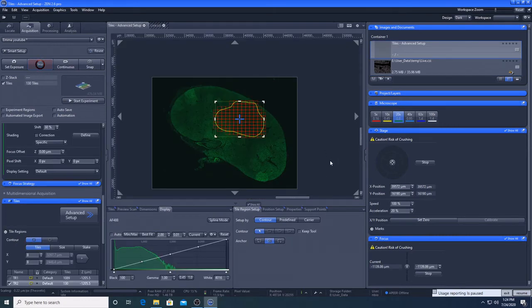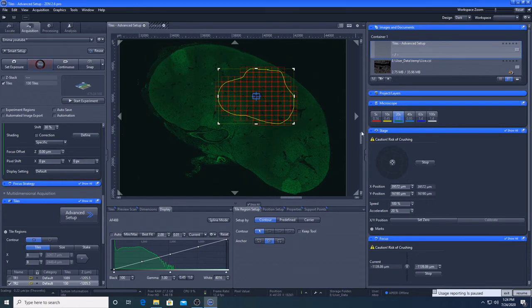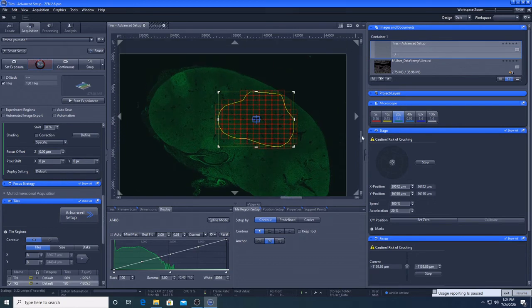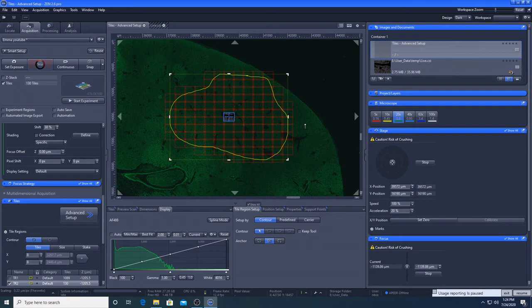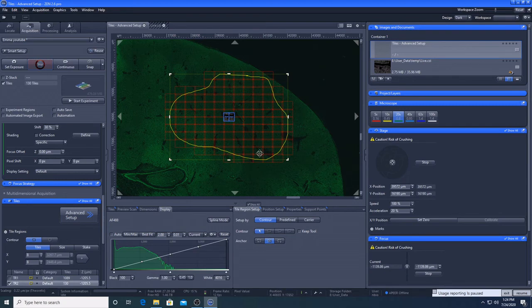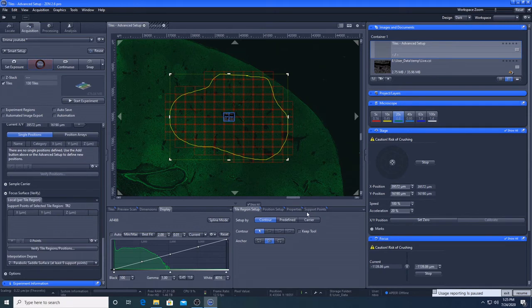So what we want to do now is, because the sample is quite thick and slides tend to bend in a certain shape, we don't want to assume that each of these tiles is going to be on the same focal plane. So we are going to put in some support points.